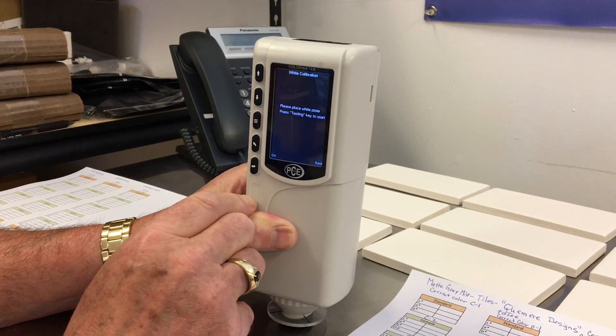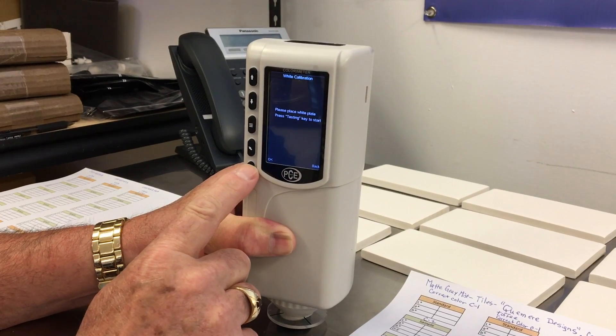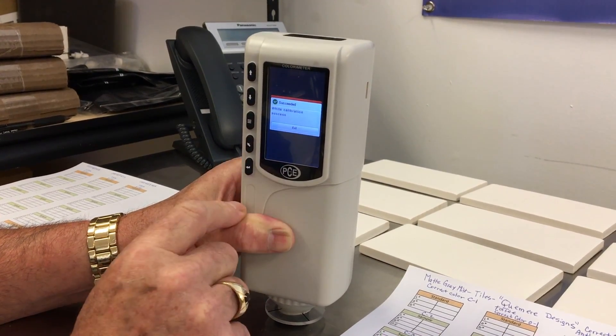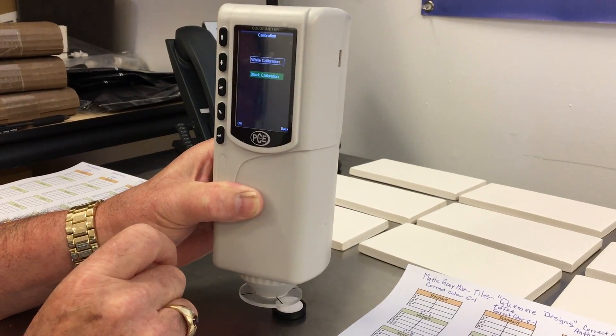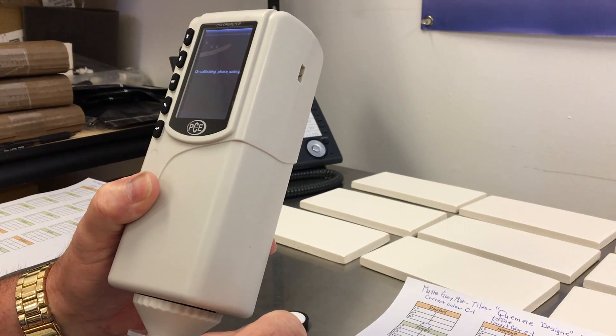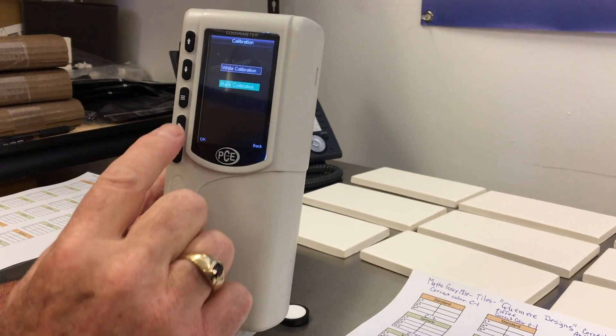Calibration. We enter — this is placed on the white space. Enter. Calibrating. Succeeded. White space is good. Now we're going to black. For black, all we do is press Enter. Now we hold it in the air. Success. Exit.